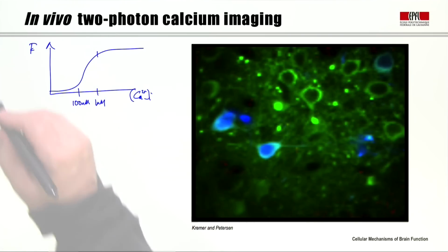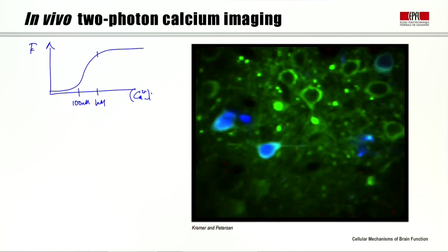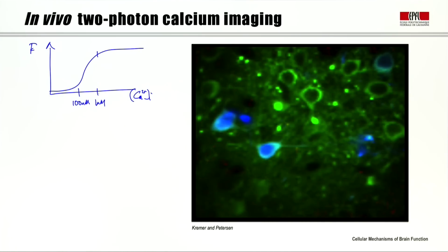So calcium-sensitive dyes have been made that are small organic molecules, and Roger Tsien also designed the first genetically encoded proteins that were calcium-sensitive, so you can put them inside animals and let those animals live with the calcium-sensitive fluorescent protein, and you can then study the dynamics of these fluorescent calcium indicators over days, looking at how neurons, spines, and synapses are behaving.